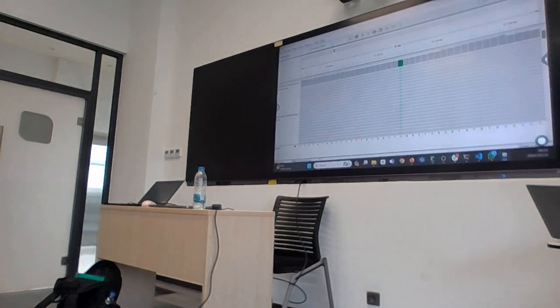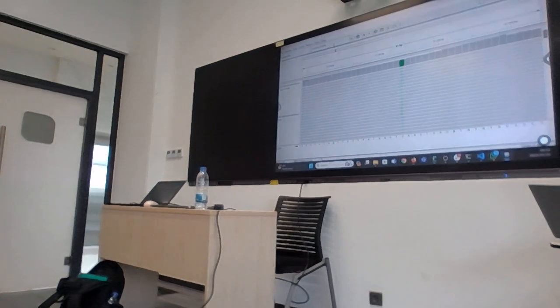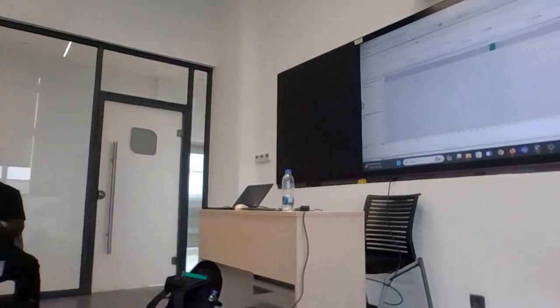what I'm seeing here, this sample of virus was collected from a patient in 2023, okay? The reference that I'm looking at was collected in the year 2018, I think. Okay, let's say it's 2018. Reference was collected in 2018.